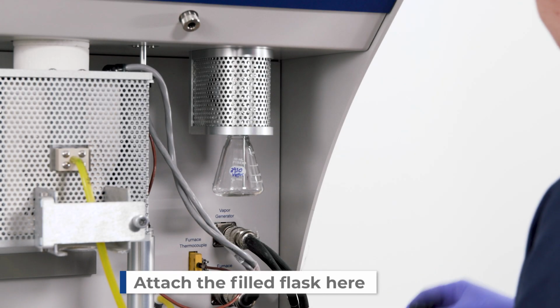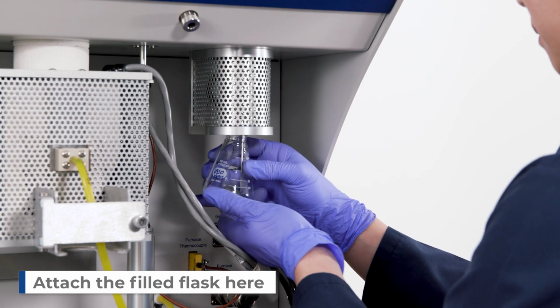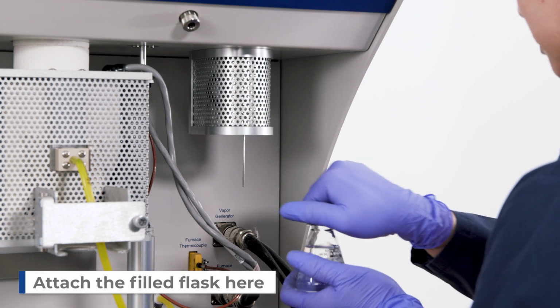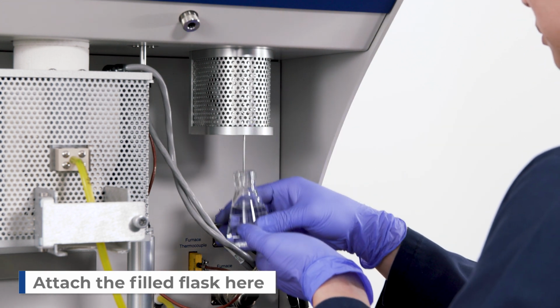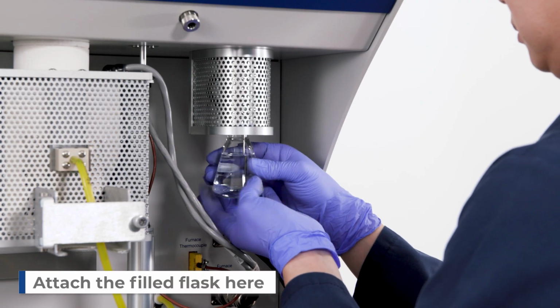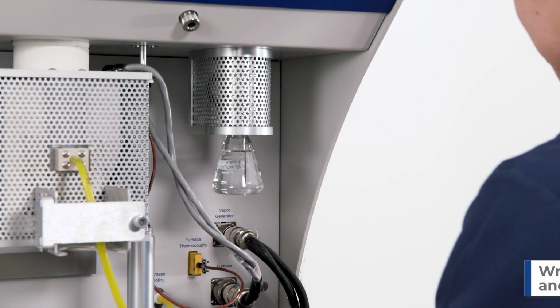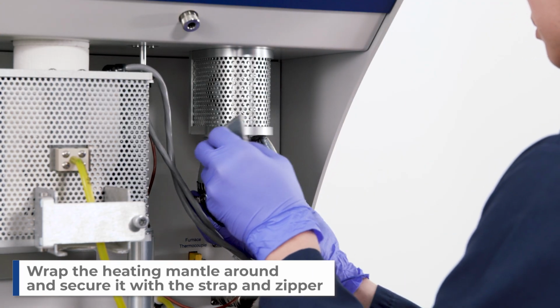Attach the flask to the instrument here. Wrap the heating mantle around the flask and secure with the strap and zipper.